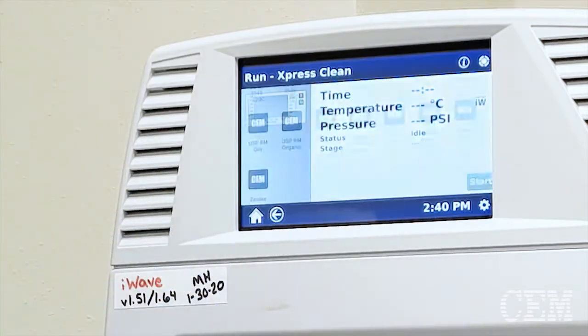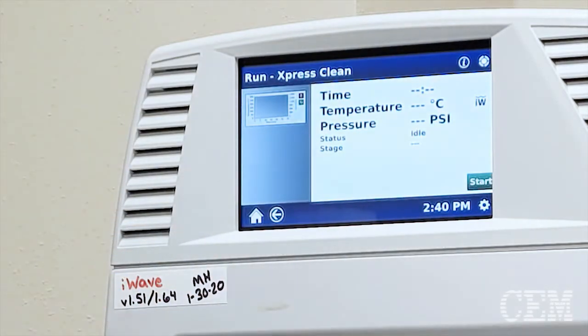All right, it's about a 10 or 15 minute clean. You want to let it run through the cycle, nuke it. After that, you want to rinse it out with DI water, let it air dry, and it should be clean.